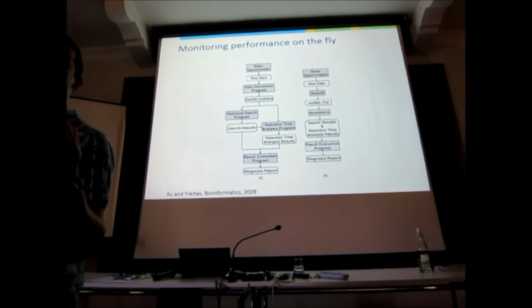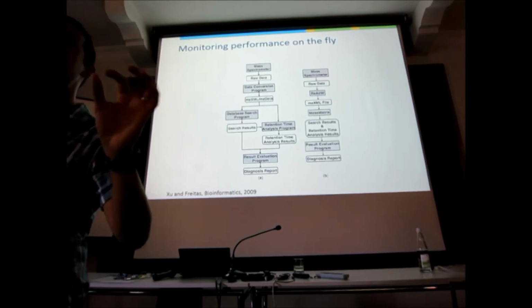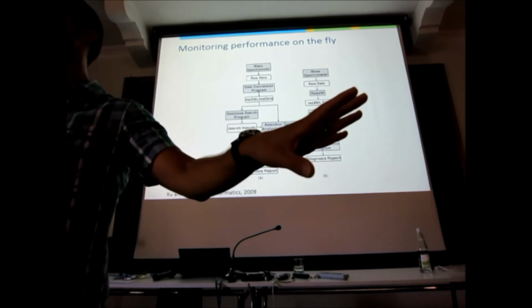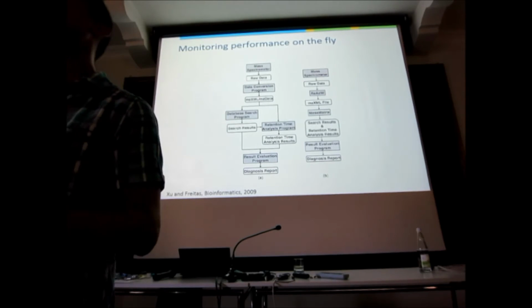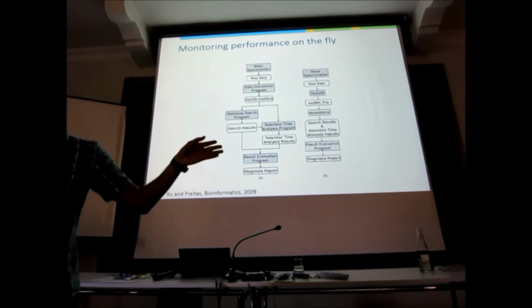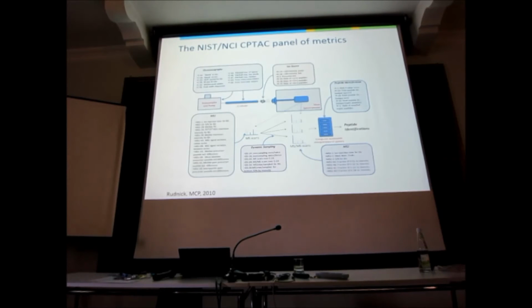If during the middle of the night your instrument went bananas, it would not continue to inject the last milliliter of cerebrospinal fluid you wrested from the poor cancer patient, but it would leave the sample there so that the next morning you could fix the instrument and then conserve the precious sample. It's a very simple, very elegant application of quality control. But they didn't go beyond this simple thing about blocking the machine if it starts doing crazy stuff. So we have to wait for NIST to come into the game with the CPTAC study. And this is NIST, the National Institute of Standards and Technology. They say how long a second lasts, right? These are serious people.